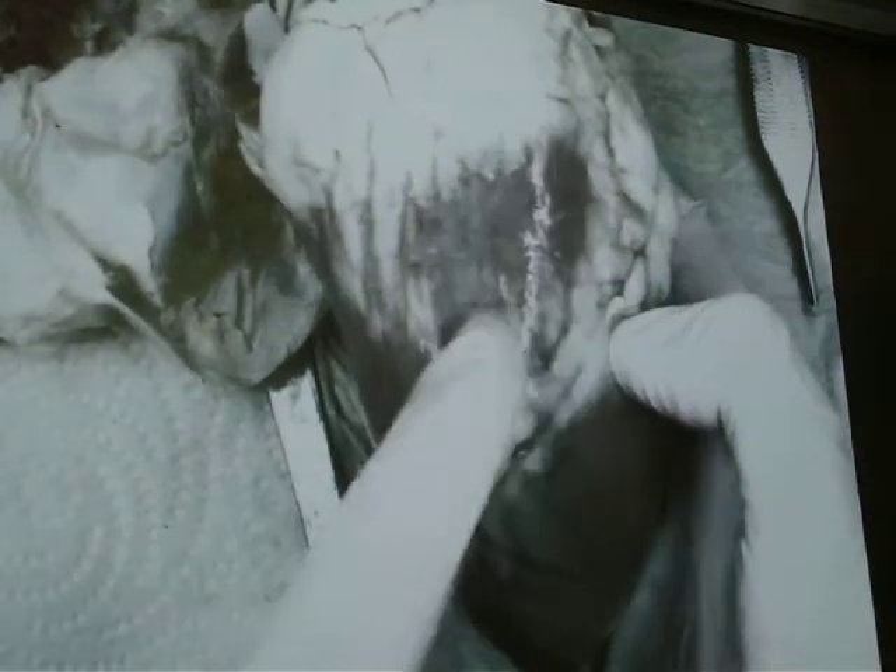Okay, that's the left side. Let's go to the right side. Remember that we have this little line of fat going around, kind of separating the right ventricle from the left ventricle. So you want to cut inside that line — cut right on that line. You're going to be right on the wall; you're not going to hit the lumen of the right ventricle. So you want to cut in there a little bit.